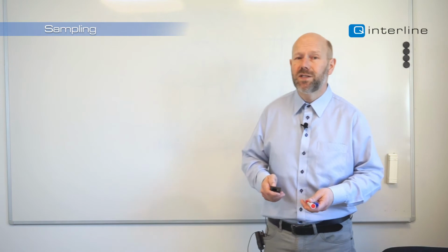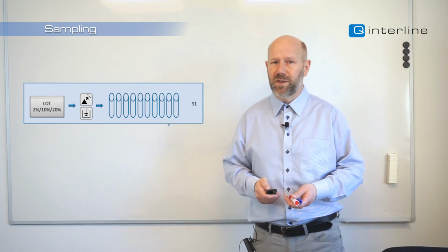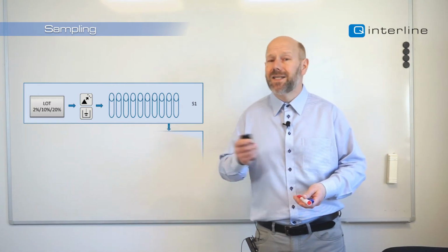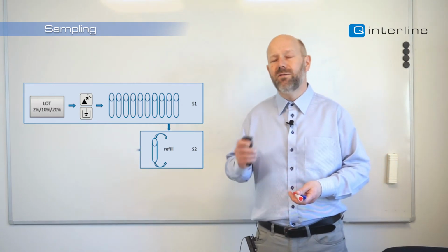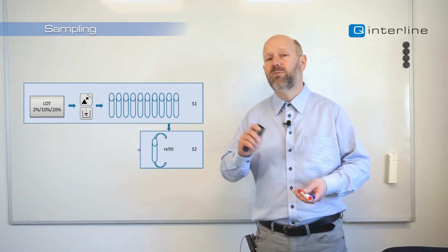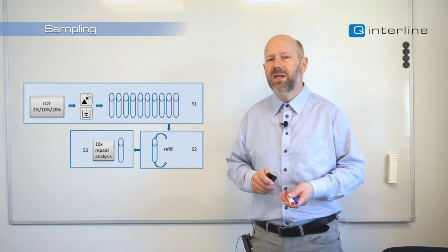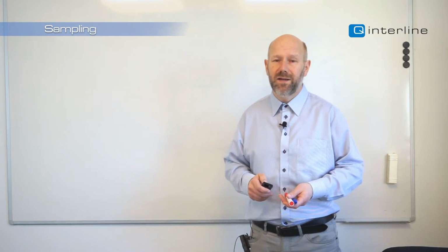The experiment was conducted so that we had a base lot, we mixed it, and we made a composite sample. We filled 10 of either the petri dish or jars or spirals and scanned them. Then in sampling experiment number 2, we took whatever was in that petri dish out of the sampling container and put it back in. That's sort of like reproducibility. And then one of those we simply ran 10 times to see the repeatability. So that was the construction of the experiment with the binary sample.